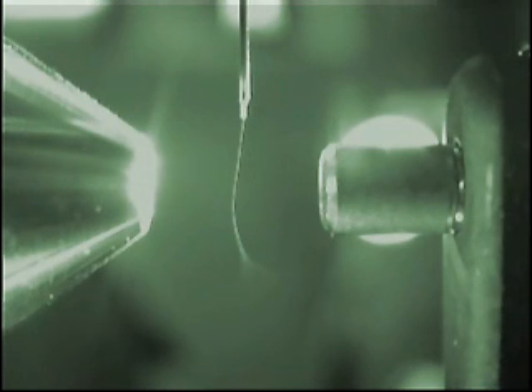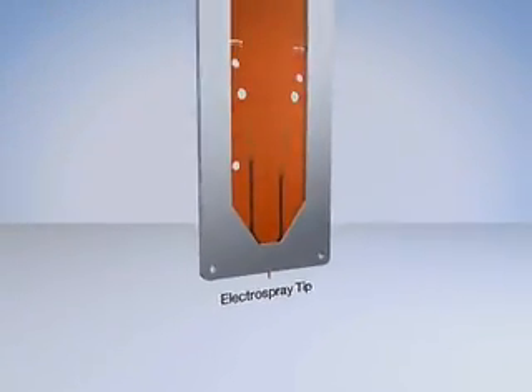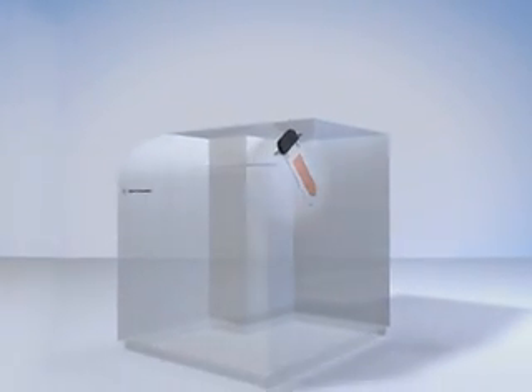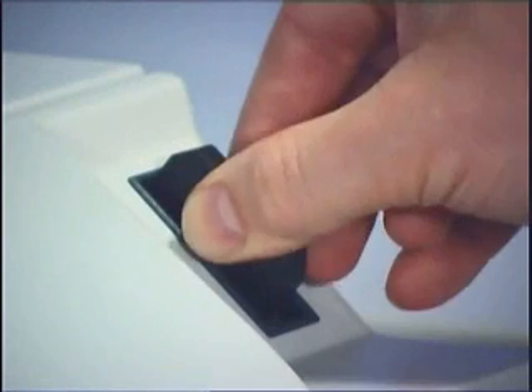Proven nano-flow LC-MS technology and the new and exciting capabilities of microfluidics combine to form a system that is easy to set up and easy to maintain. Scientists can now get more results faster. The flexibility of the HPLC chip design and the HPLC chip cube-MS interface micro-valve technology in integrating additional chemistries and separation strategies opens up a wide range of potential solutions for many research challenges. On-chip multi-dimensional nano-LC is one of many possible new applications.